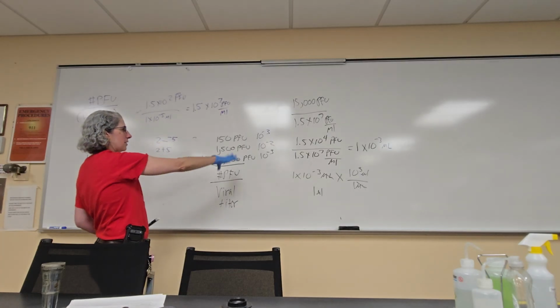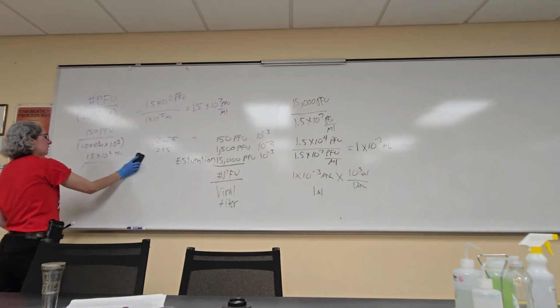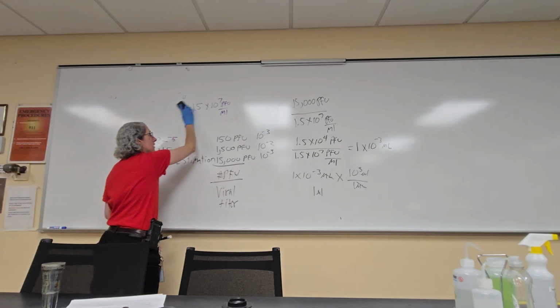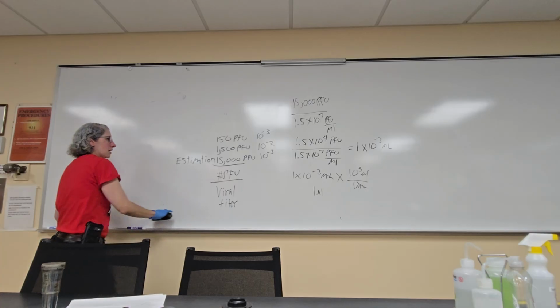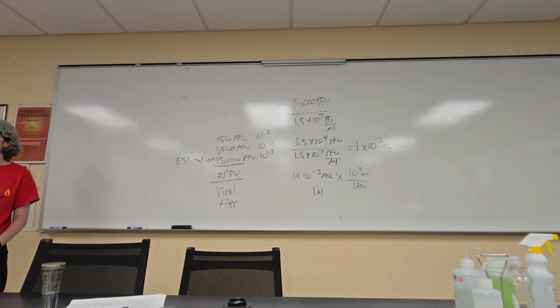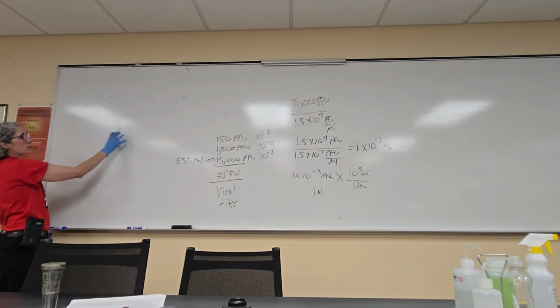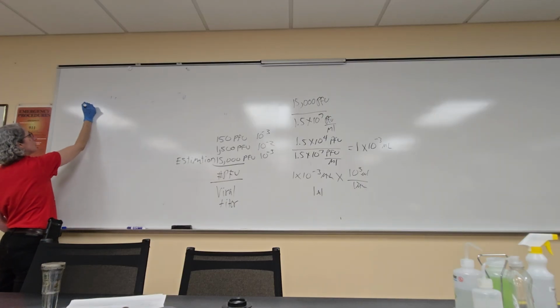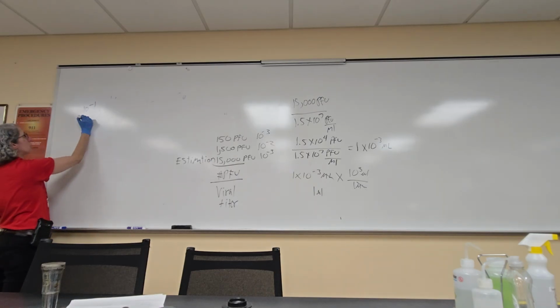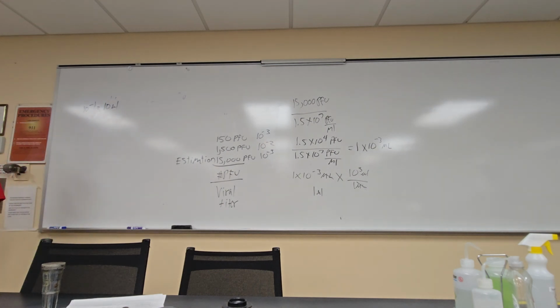So to solve this problem here, we can go ahead and make a dilution of your lysate, so we have a greater volume that we're using. So go ahead and make a serial dilution. It could be a 10 to the minus 1 dilution. Instead of 1 microliter, you're going to be using 10 times more. So that's going to be 10 microliters. A much easier volume to play with.